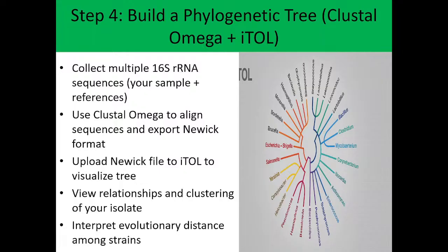That is, which is going to be your own sample, the one that you have collected, plus other references. Now, something should come to your mind. A phylogenetic tree can only be plotted if you have more than 3, 4, 5 sequences. So if you have 2, for example, a 16S ribosomal RNA sample from Shaki here, and you have another sequence from another site, and those are your 2 samples, you know you don't have more than 2.